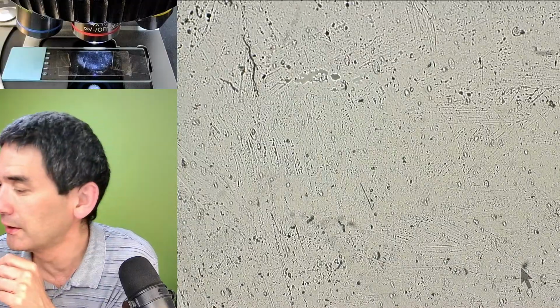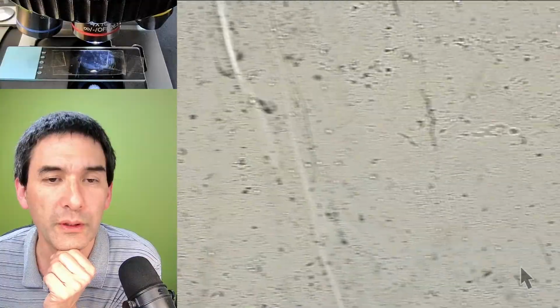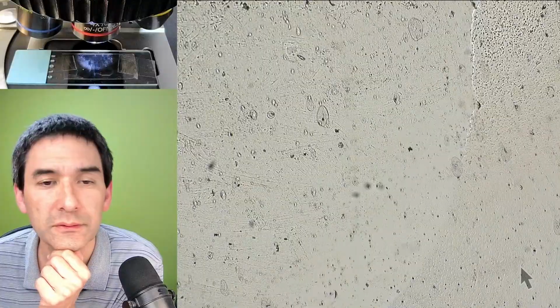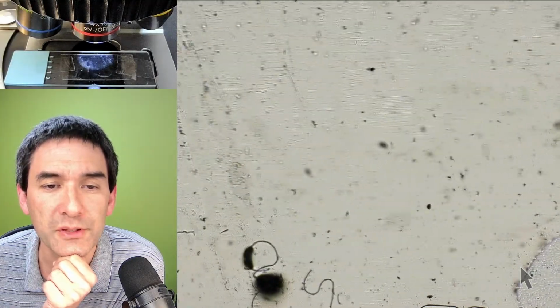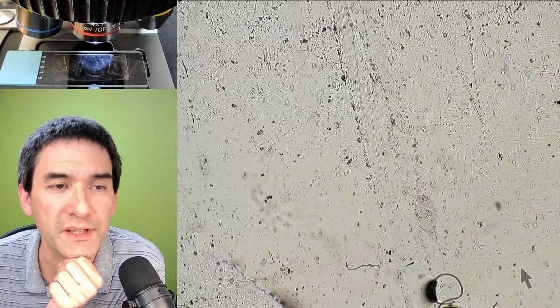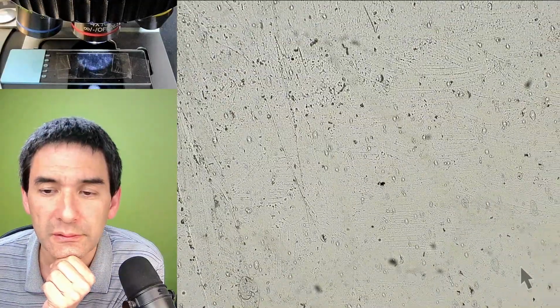Still haven't figured out why, for whatever reason, it takes quite a long time. You see, everything is much more transparent where the oil is, so the skin cells are not quite as visible anymore. Okay, and then if there are any face mites present, and I don't know if this one here, for example, is one or not, they will be much better visible. But I have not been able to find anything.